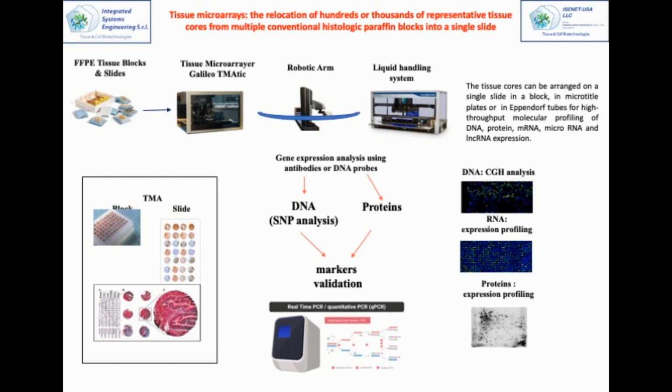As you can see, the GalileoTMAtic platform allows to make a TMA block, giving the opportunity to analyze hundreds of tissue cores simultaneously under the same conditions, and make a molecular and genetic analysis of each extracted tissue core from the same block and near the tissue core placed into the TMA block.